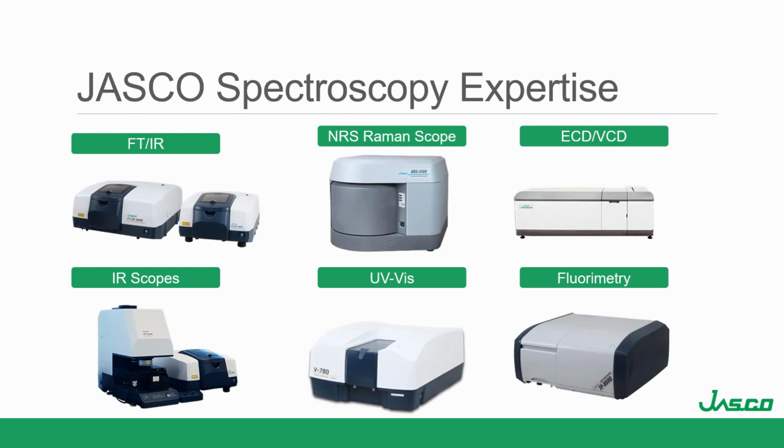We have a wide background of spectroscopy. We have FTIR, Raman, circular dichroism, both electronic and vibrational, IR microscopes, UV-vis, and fluorimetry. And today we're going to be talking about FTIR.